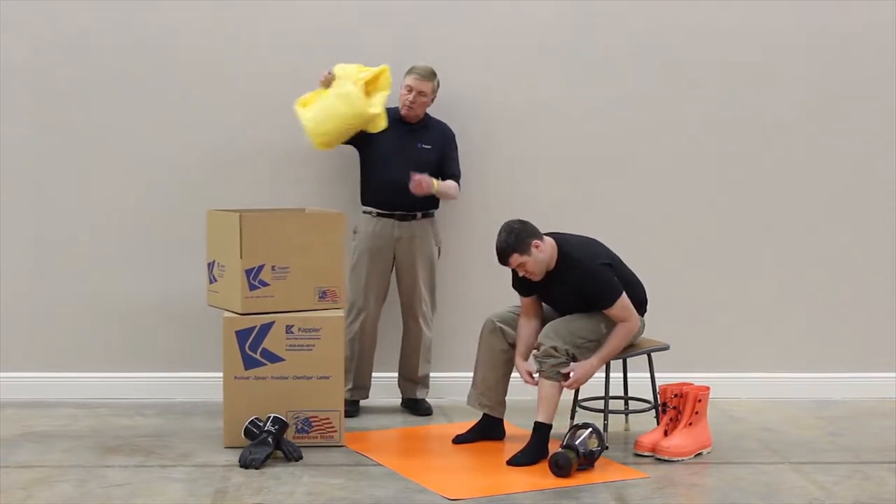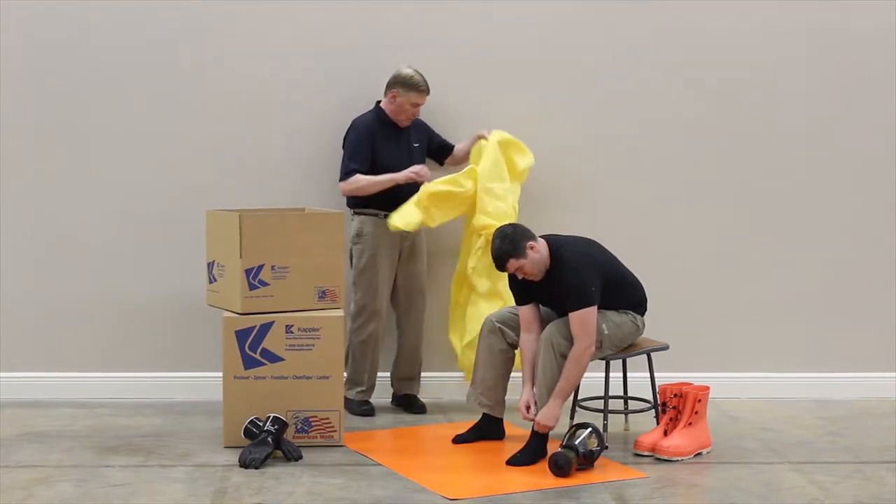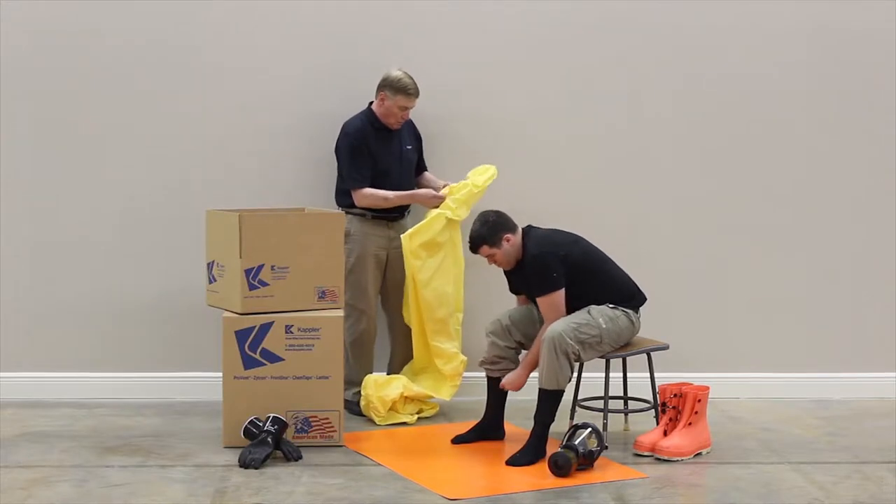The sock boots on this garment are worn inside outer chemical boots and do not have adequate durability to be worn over footwear or alone.